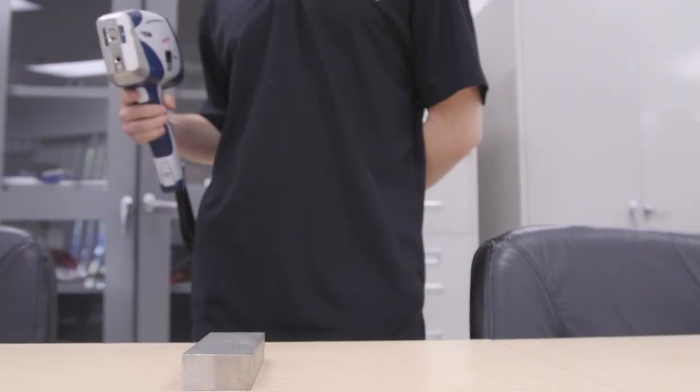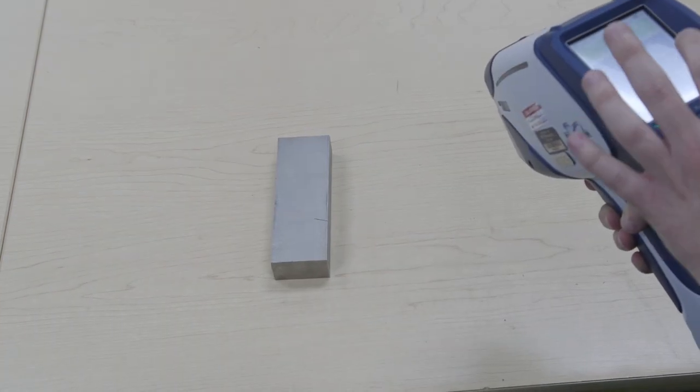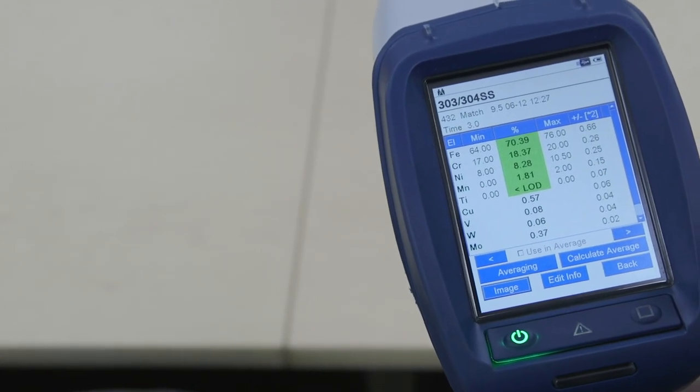The results from the XRF gun give us a table of elemental composition and allow us to positively identify a material, which helps us determine laser processing parameters. We can inspect these parts at a macro level as well as at a micro level, getting very detailed information in terms of anything that the laser may be doing to the samples.